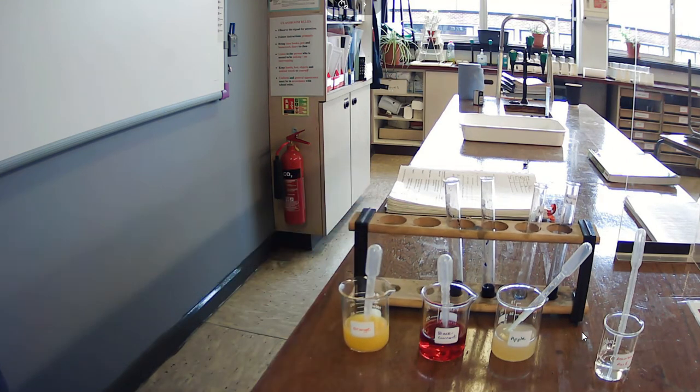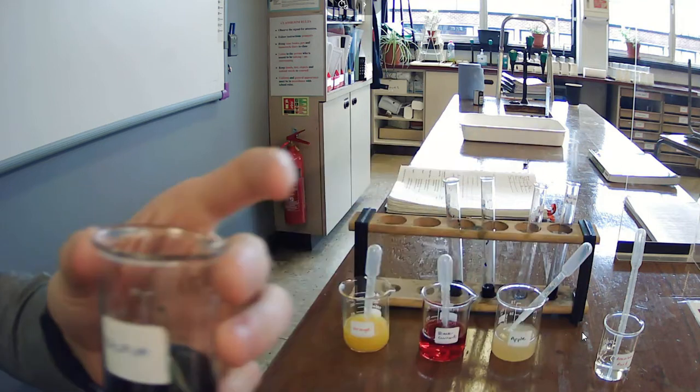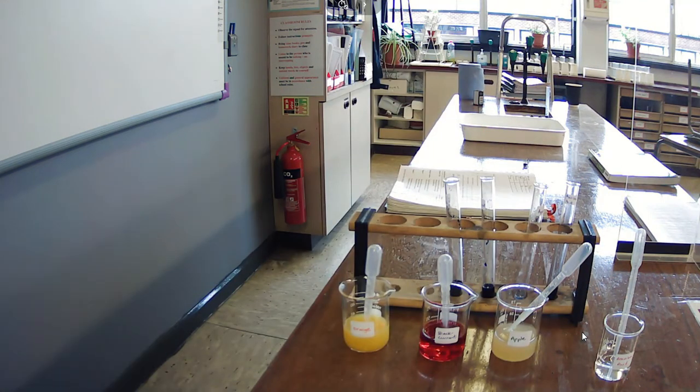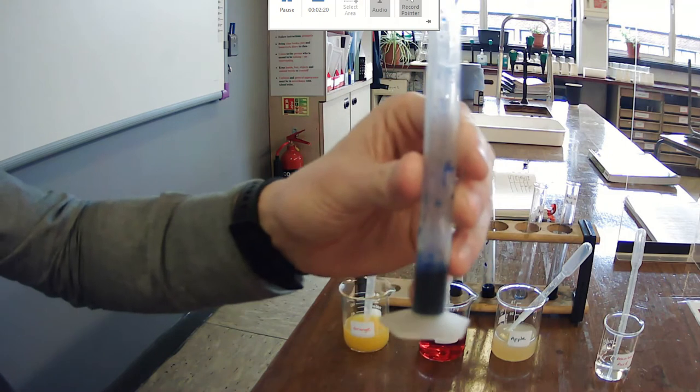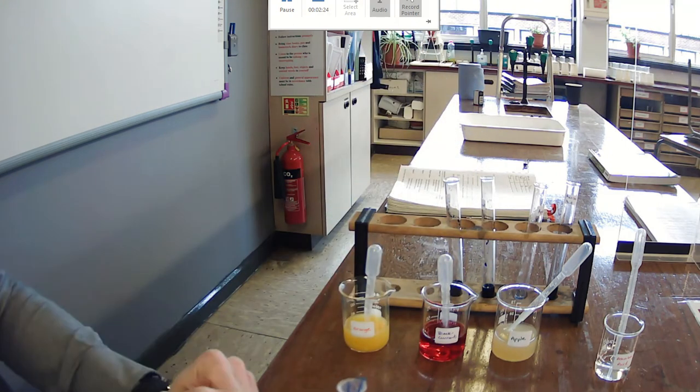Now it probably doesn't do any harm to try and predict which one you think is going to have the most vitamin C. Here we have our blue DCPIP, the dark blue chemical which is used in this test, and already measured out we have two centimeters cubed of DCPIP.